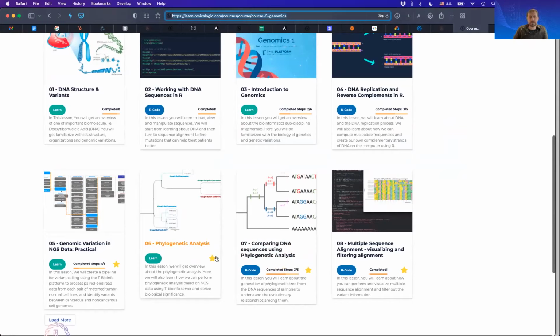And thank you, Sanjay, for the question. Does the pipeline also include the suggested software and programs? Yes. So based on the pipeline, you will be able to download and install your own software if you want to rebuild the pipeline on your own.